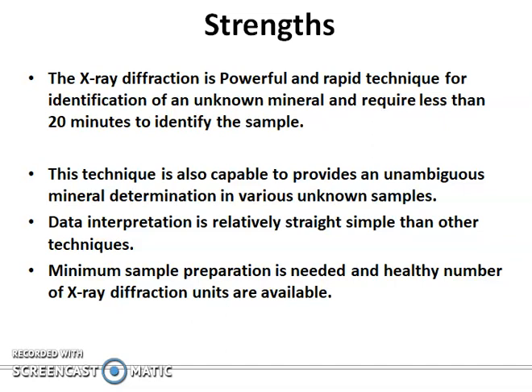X-ray diffraction is a very powerful and rapid technique for identification of any unknown mineral, requiring very little time, less than 20 minutes to identify the sample. This is very useful for identification of various types of minerals in different unknown samples. It is a very straightforward technique, and only a minimum sample is required.